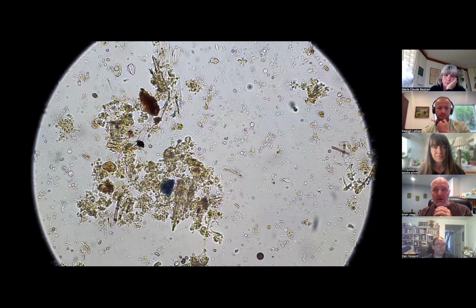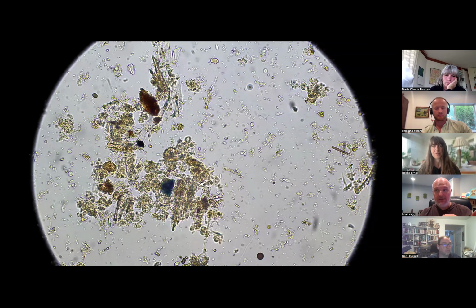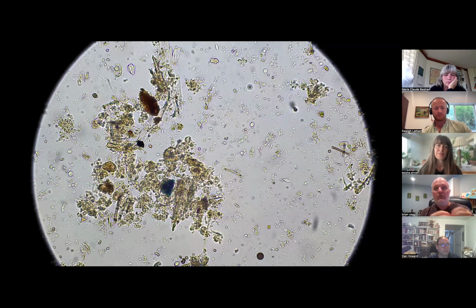I've taught a number of our clients how you use a microscope, and here's how you do your own qualitative analysis. And when something goes awry for them, like, ooh, things have changed, either for the positive or for the negative, then it's a prompter for them to say, hey, let's have a discussion around this. And they can show it on their camera, and we can look at it.